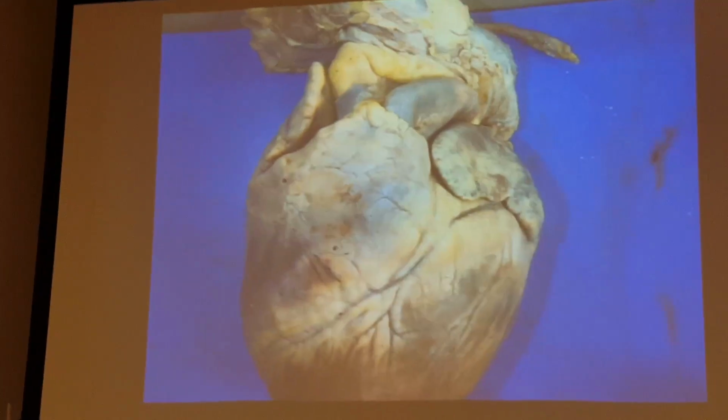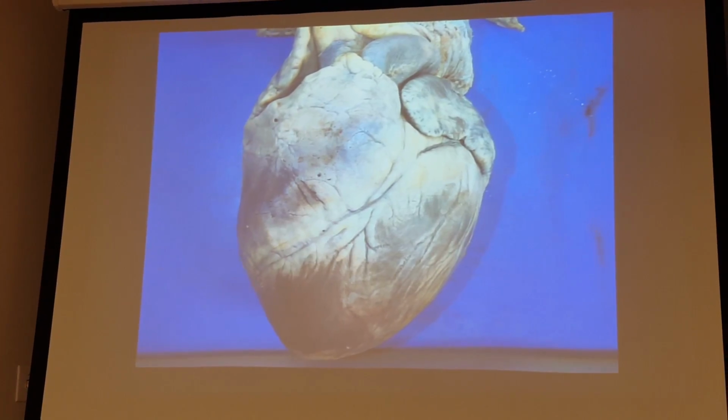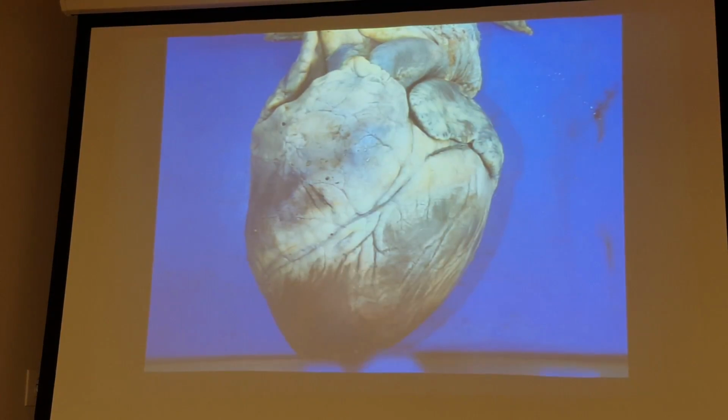I think I'm just going to set out quite a big room. Okay, so here's a heart, and this is about human size, right? Pretty close, yeah?